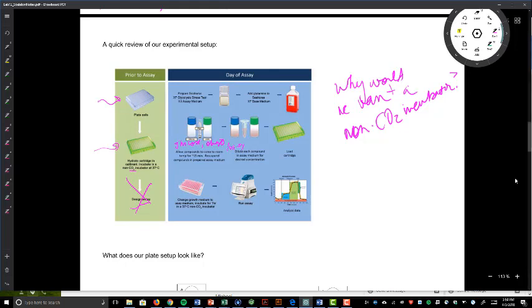And this will actually be done after we've prepped the cells. So the cells have been growing in a different media overnight. That's not the Seahorse media. At that point, Manish will show us how to pour off the extra media we don't want and replace it with the special Seahorse media that is needed for the glycolysis assay. Then once we've prepared the cells, we'll take the loaded cartridge, put the pieces together, put it into the Seahorse, and run the assay.